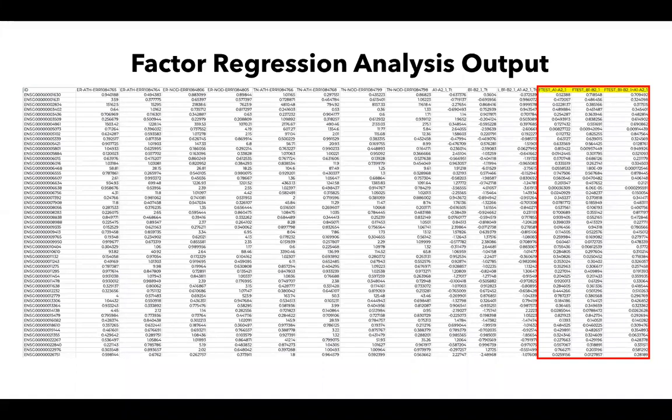So you can see the genes, their ID on the extreme left side. You can see their expression levels, and now you can also see the result of F test and T test in a single place. Now all you would have to do is to plot these numbers and see what they mean.